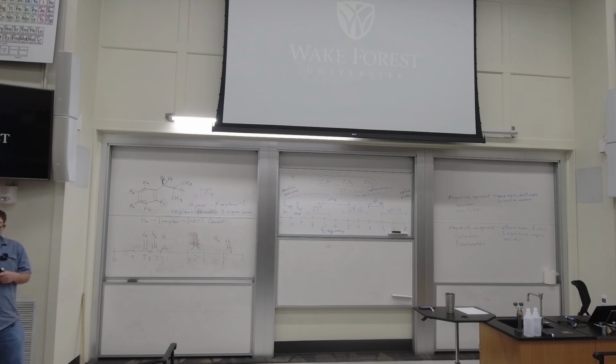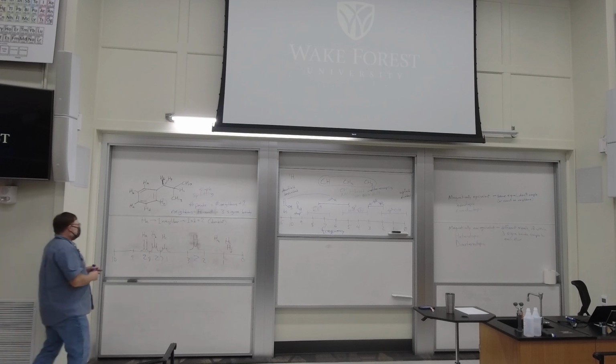The first NMR I ever took about 30 minutes to run, and it got printed off on this sheet. You didn't save it to disk. Nobody had a disk that could save that much data. It printed off like a poster. I wish I had kept one. Probably worth some money at this point. And the computer would plot this kind of titration-like curve, and you'd measure the heights of those. The height might be 11.5 centimeters, and you had to find a proton that you thought was 1 and set that at 1 and multiply. Anyway, now the computer spits it out.